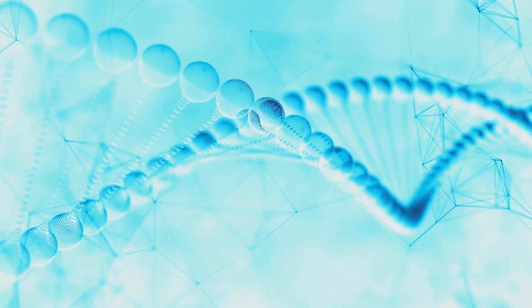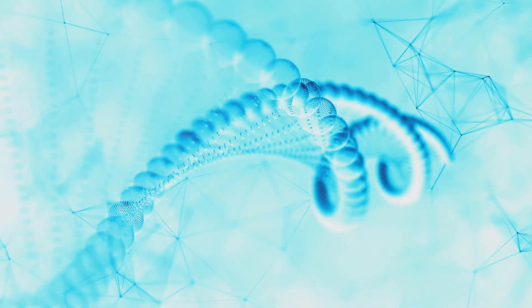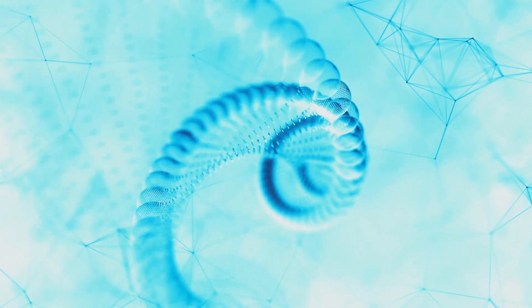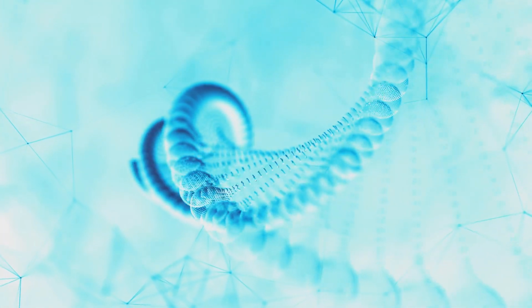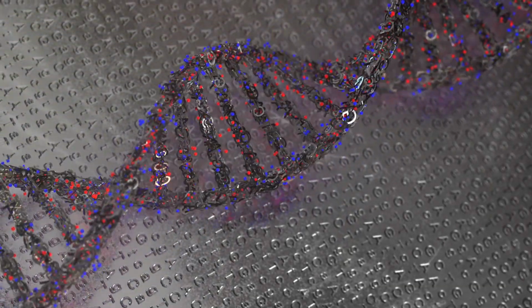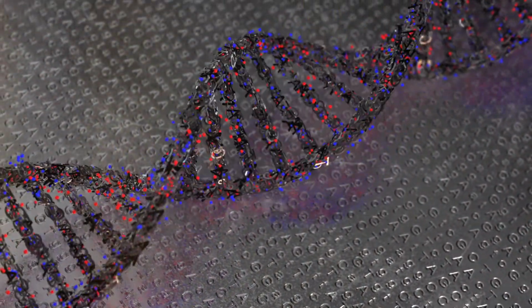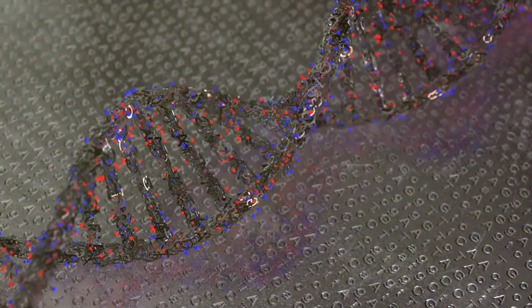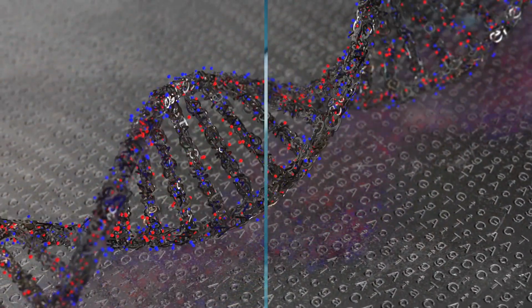Each of these physical methods of transfection has its own strengths and weaknesses, and the best choice often depends on the specifics of your experiment. Are you working with a hard-to-transfect cell type? Do you need to introduce DNA into a large number of cells? Do you require temporary or stable gene expression? These are the kinds of questions that can guide your choice. The choice of transfection method depends on various factors, which we will discuss next.